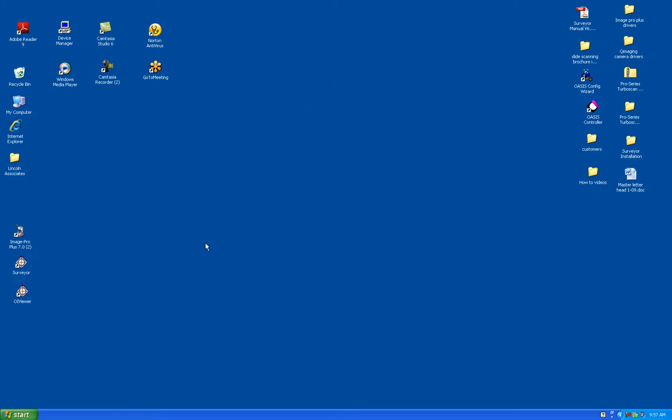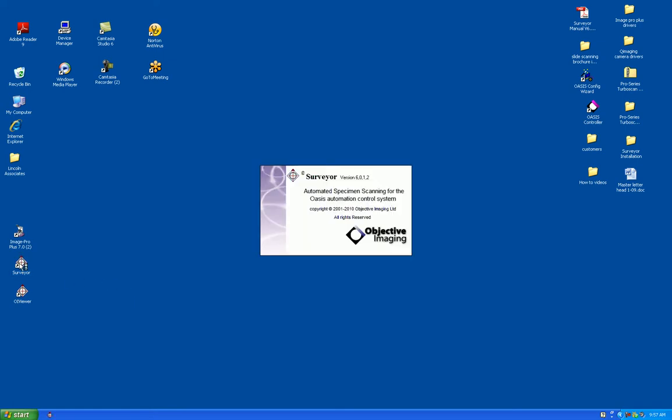The following video is how to use Surveyor for high-speed scanning of microscope slides. If you double left click on Surveyor, you will open up the Surveyor window, which will show you the live video window of the camera.